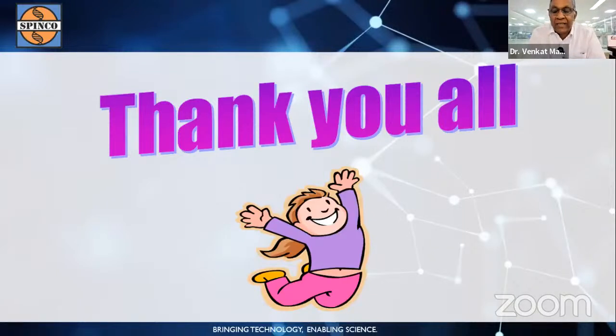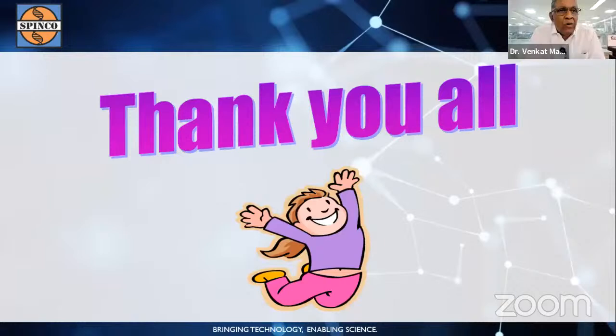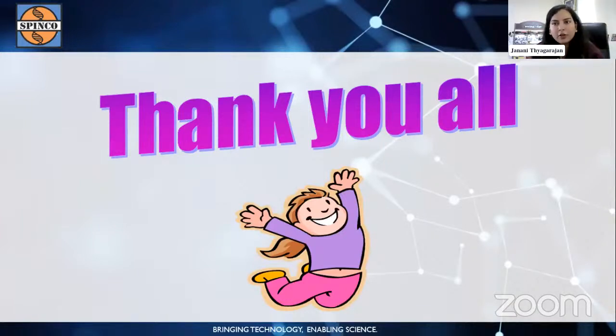We have one more anonymous attendee, and he asks, how to measure compounds having more than 2000 Daltons using triple quadrupole? When we discuss it, we will talk about how you should look for multiple charged ions. I think there's also deconvolution software that helps with that.